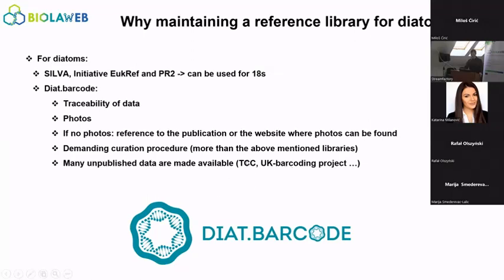There are some reference barcodes from our culture collection, but also from a big project that they had in the UK. They made all this data available and it is integrated in Diatom, and it's helping a lot because it was a project for rivers. So when you want to work with metabarcoding on diatoms in rivers, it's very useful.